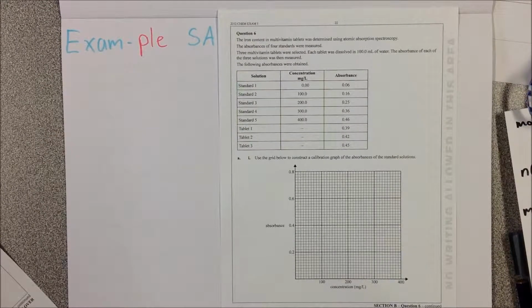Use the grid below to construct a calibration graph of the absorbances of the standard solutions. Now, a calibration graph is the same thing as a standard curve. So if you remember how we do our standard curves, we just plot all the points of absorbance and concentration of our standards and join the dots.